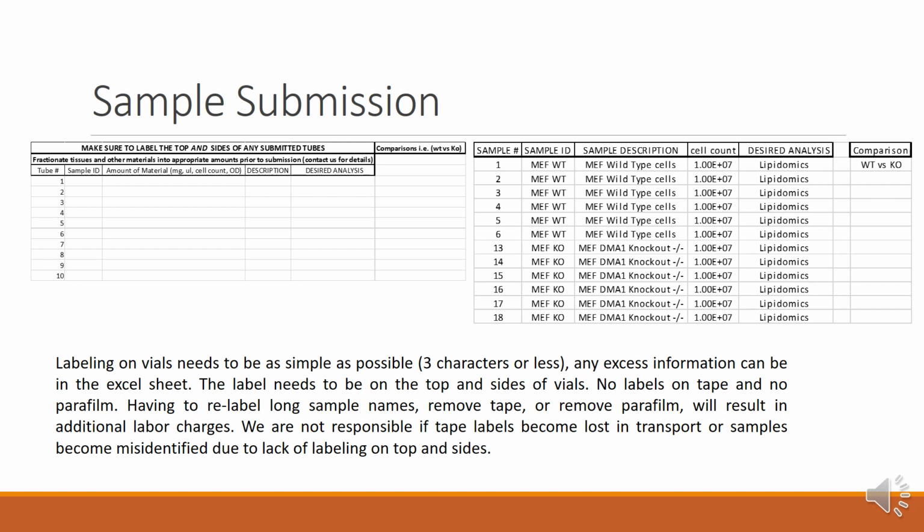Shown here on the right hand side is a perfect example of a very well filled out sample submission form. This particular researcher just labeled the vials with the numbers, and then they put all the additional meta information inside the Excel spreadsheet.